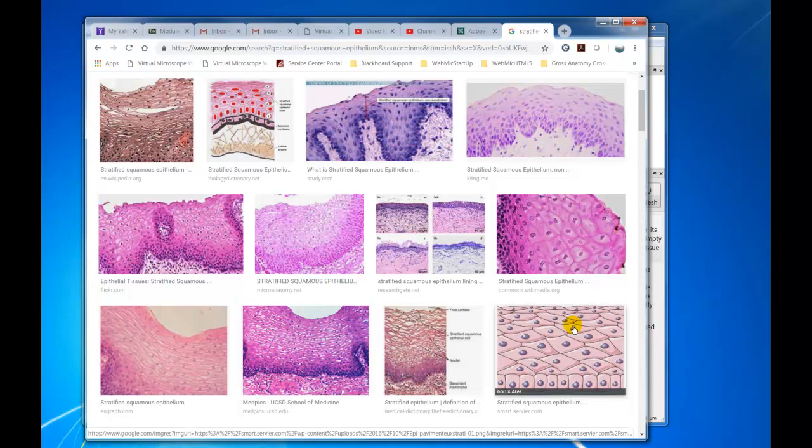So you see how you can use the resources we provide in WebMic. Then we go to Biolucida and virtual light specimens, and then you go to the internet, and all that reinforces one another. And once you go through that and you view the lecture a couple times and go through the PDF of the lecture, you ought to be prepared to take your first attempt at all module quizzes.